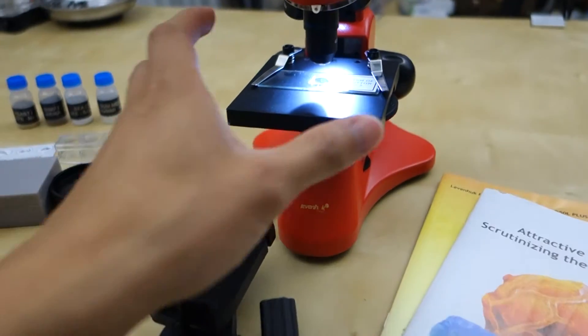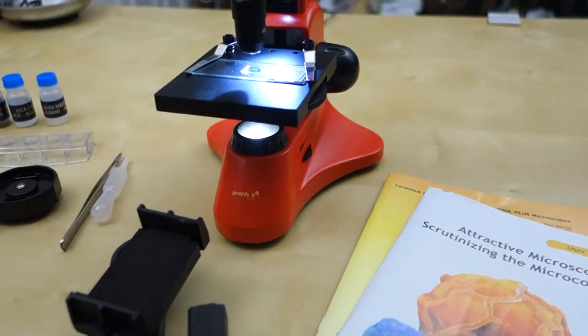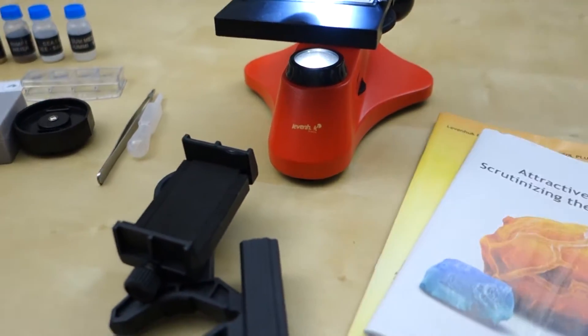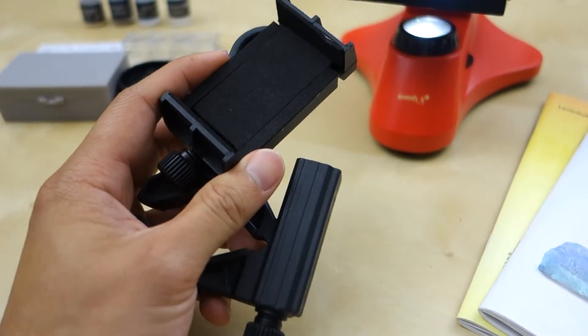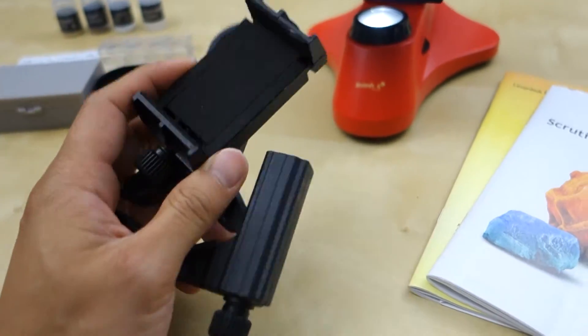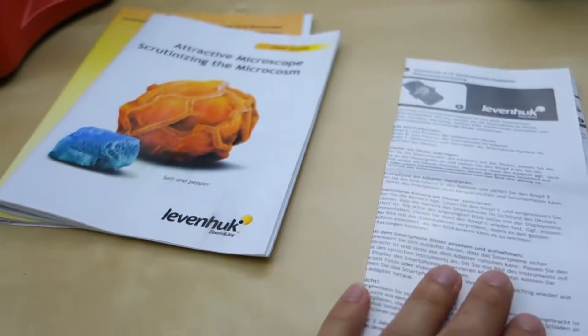It's definitely not a scientific grade by no means. It's pretty well built, but I'll show you guys that in a minute here. I also have here the phone adapter. This is an accessory that you have to buy extra. And the phone accessory also has a little user manual here.